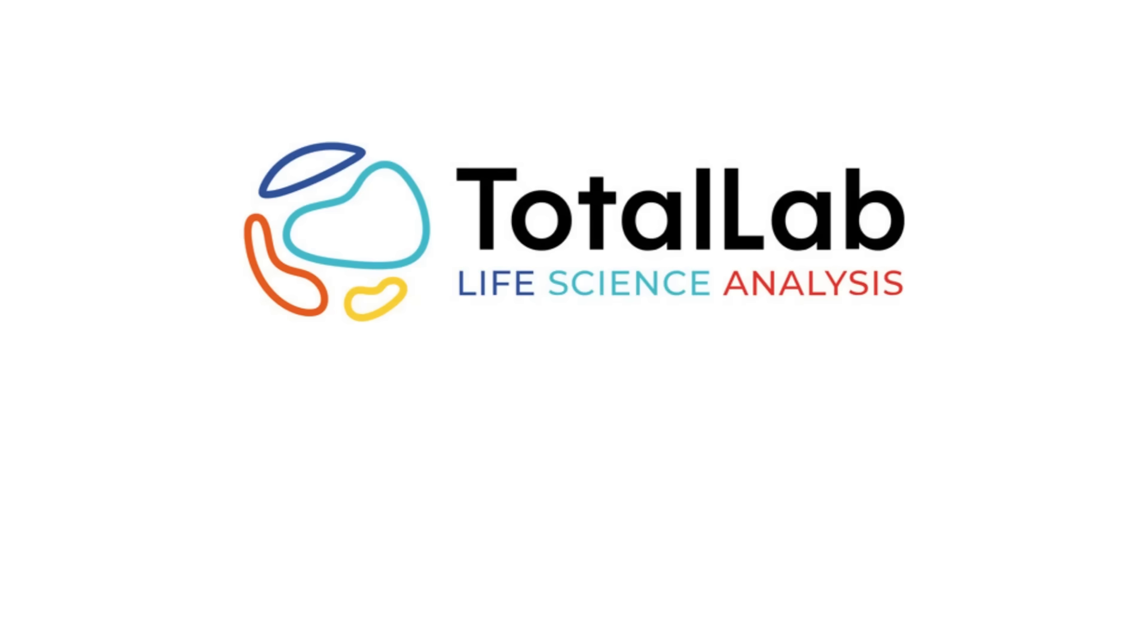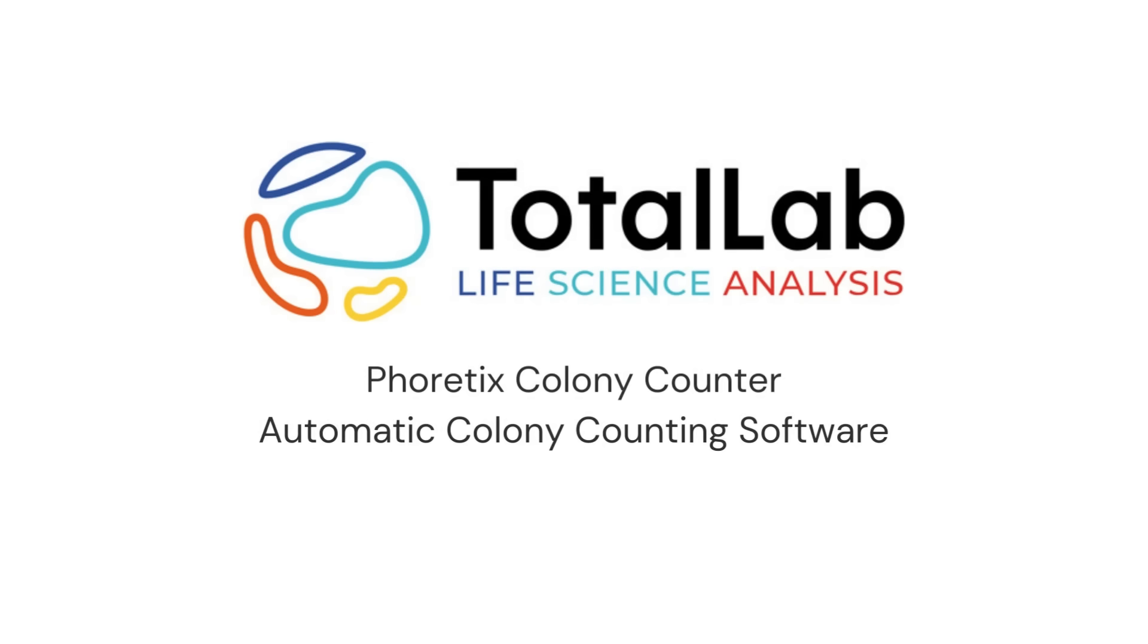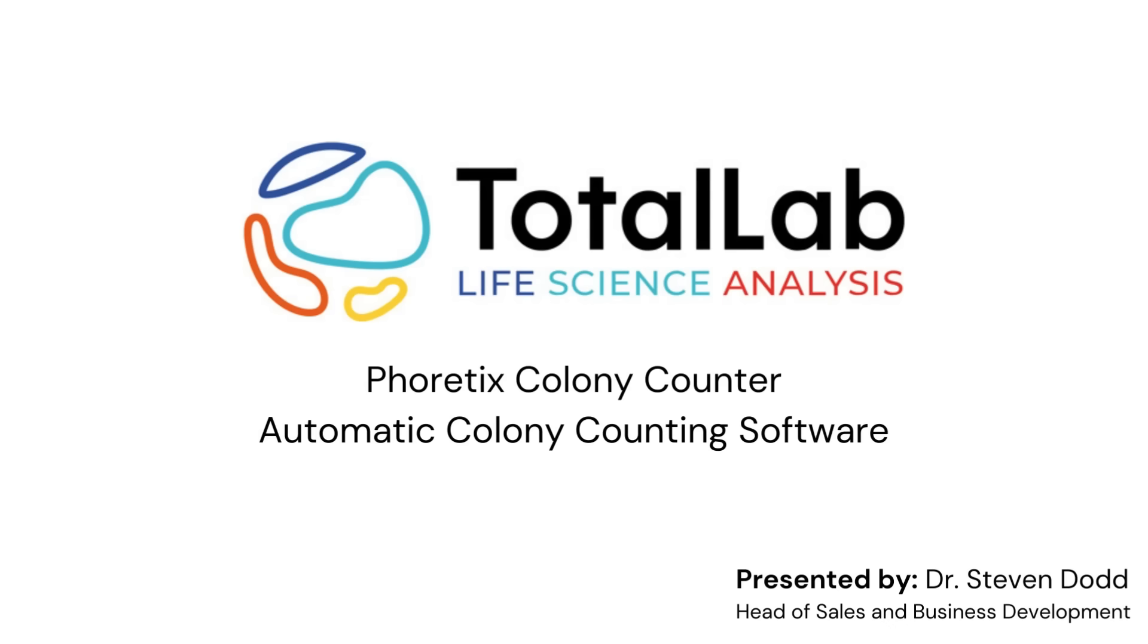Hello everyone. Today I'm going to be guiding you through TotalLab's latest image analysis software, Colony Counter, which can be used to count cells, particulates or bacterial colonies within images automatically without the need for additional equipment.